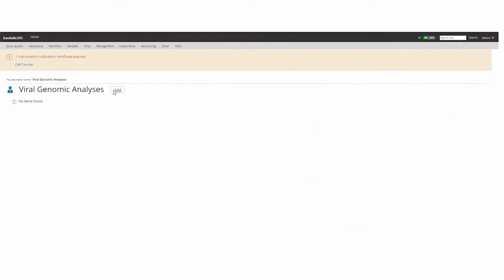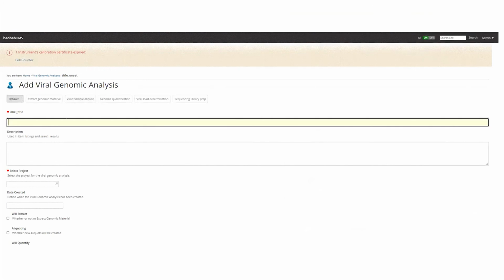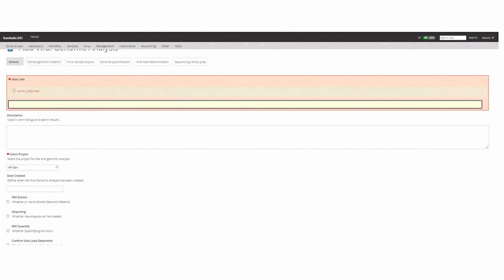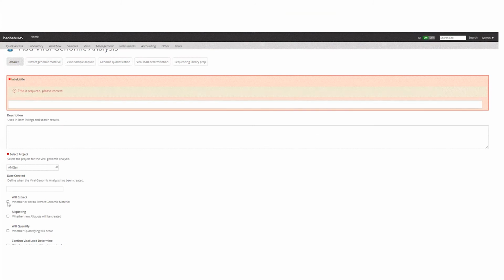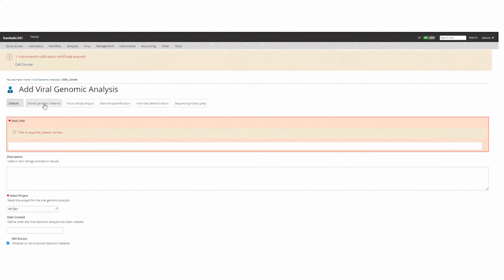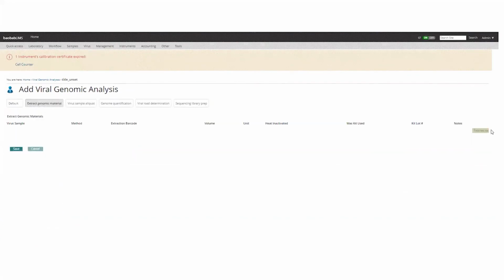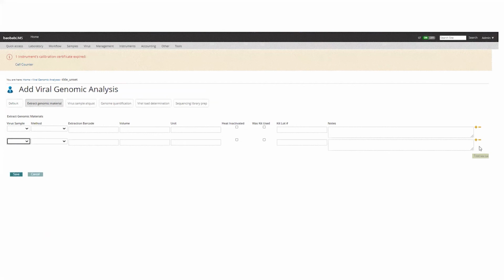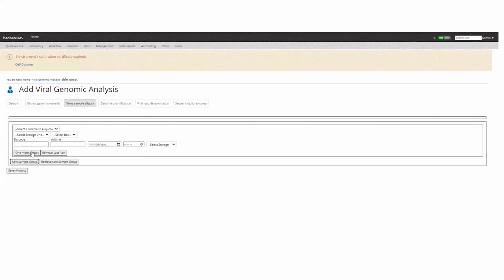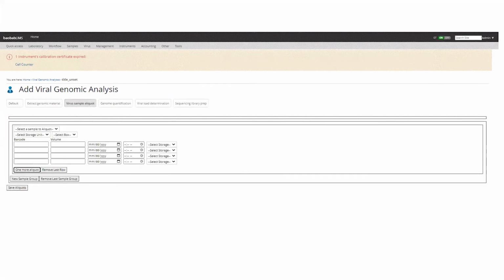The Baobab LIMS team did, however, take this a step further and created the standalone viral analysis module. This allows for data related to basic laboratory workflows for COVID research to be entered. All 5 modules can be used together or in a variety of combinations, depending on user need and capacity. In all of the sub-modules, high throughput is taken into consideration by ensuring users can add or remove rows, depending on sample numbers for each experiment.